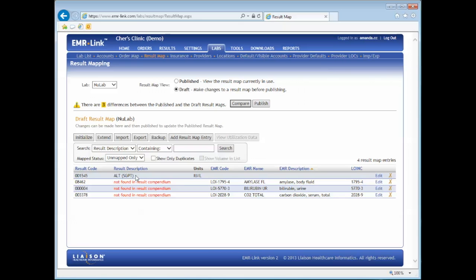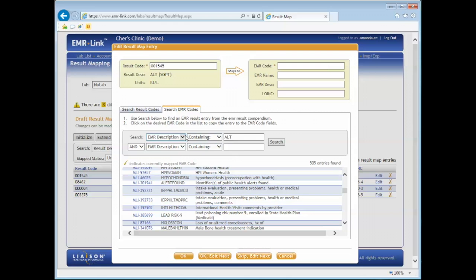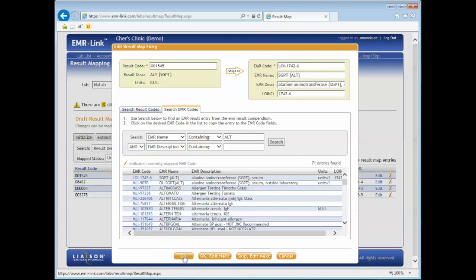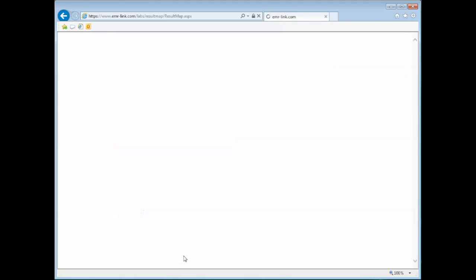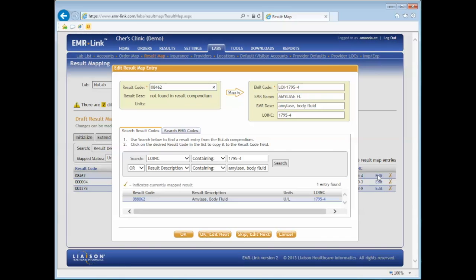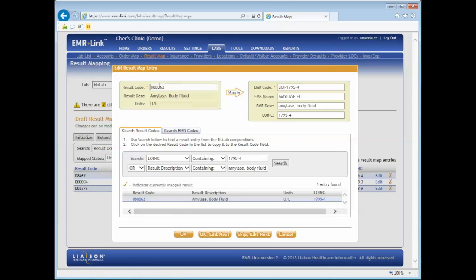You'll need to continue mapping until finished. Once you are finished with the mapping, whether you've mapped all codes in one setting or done a few at a time as time permits, you'll need to publish your result map.